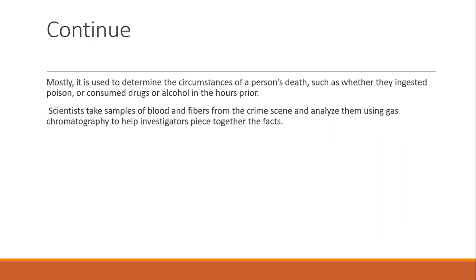The overall summary of these applications is that there are a wide number of applications of gas chromatography. Its benefits, such as its high sensitivity and relatively cheap operating cost, have made it appealing to many industries needing to detect and measure compounds and molecules within a sample. The method will likely continue to be a key technique used across all sectors. So there is a vast range of applications of gas chromatography in the world.